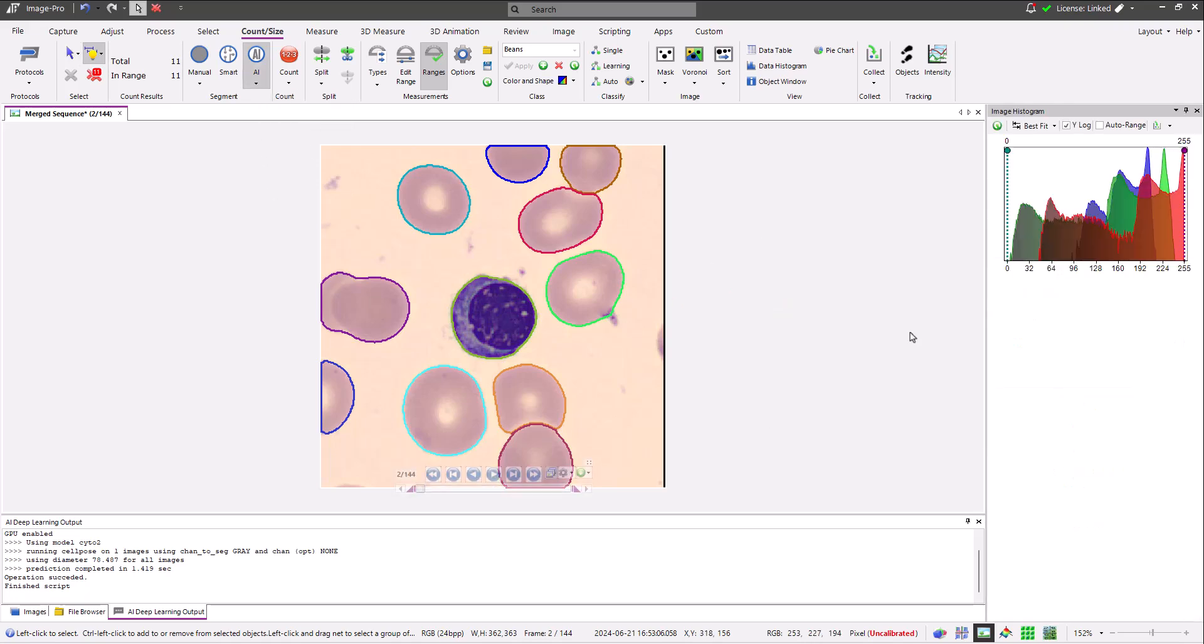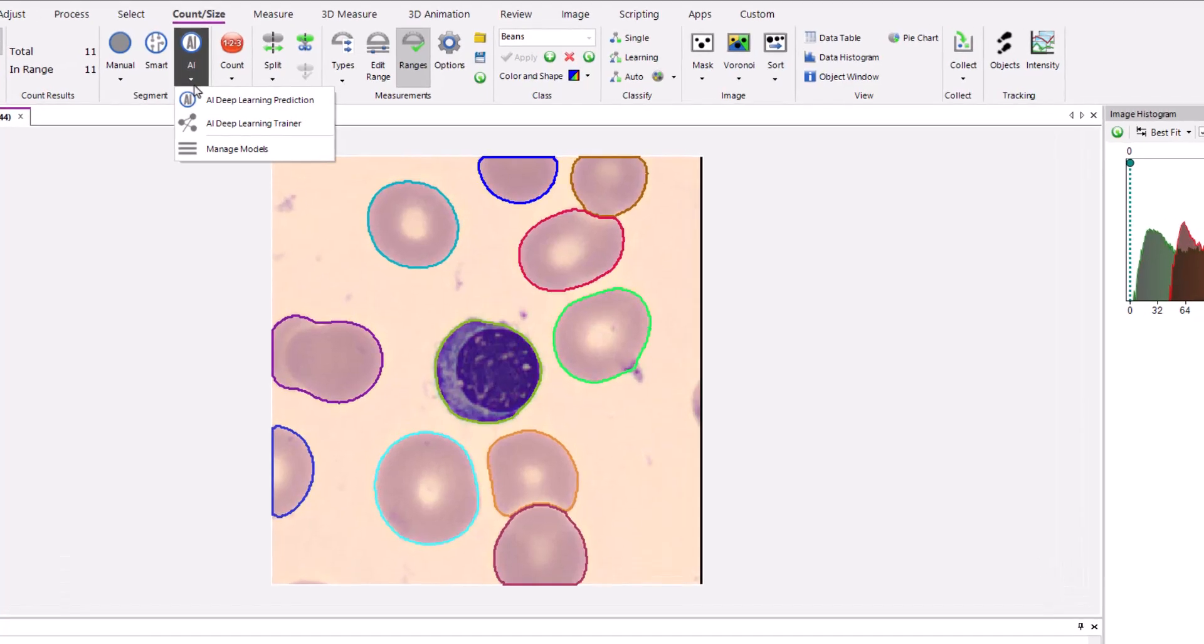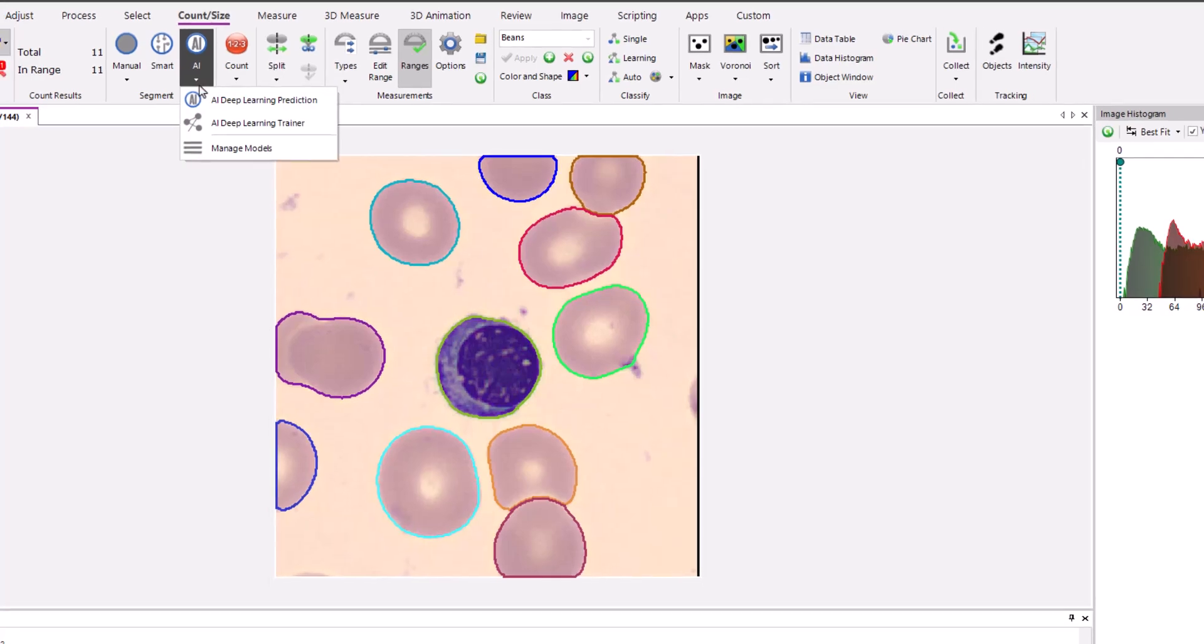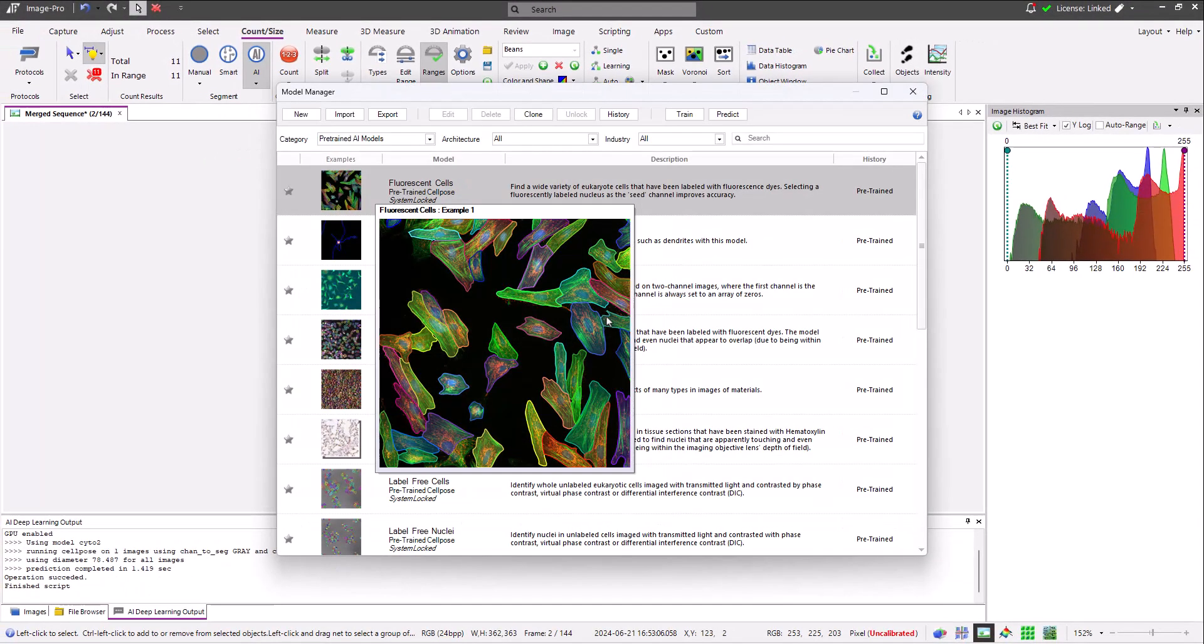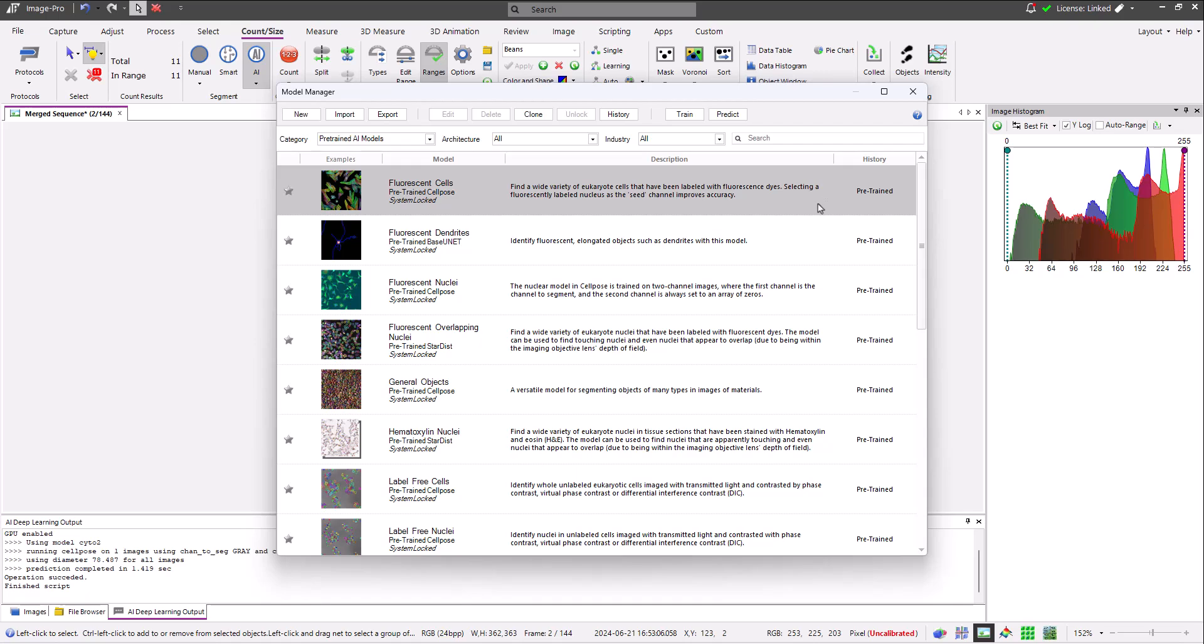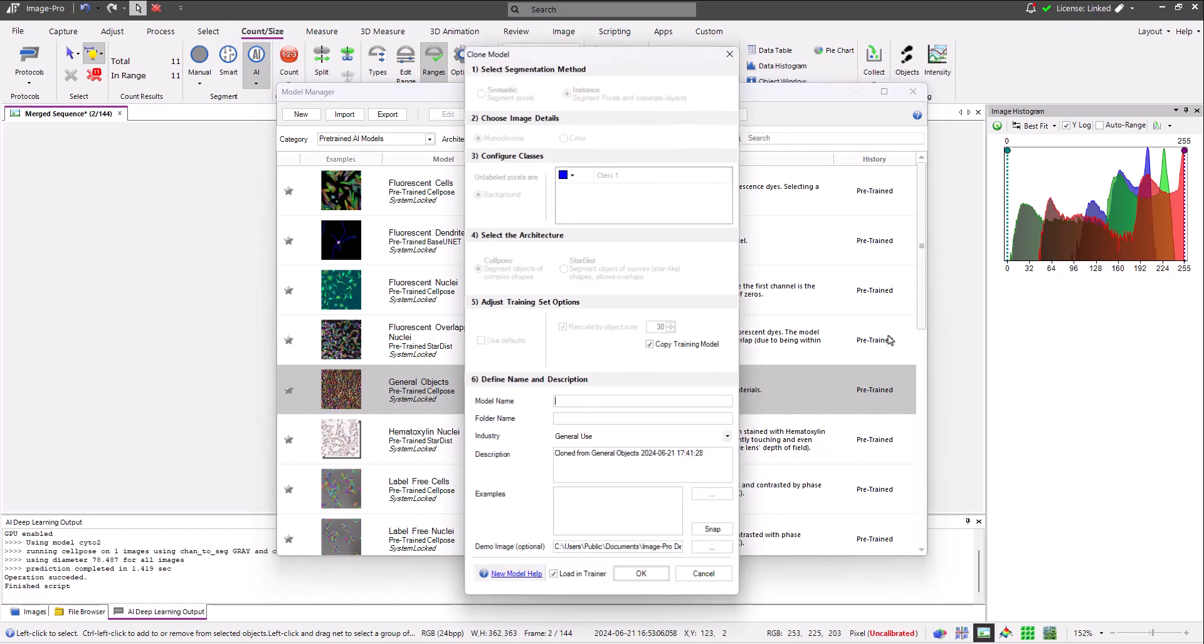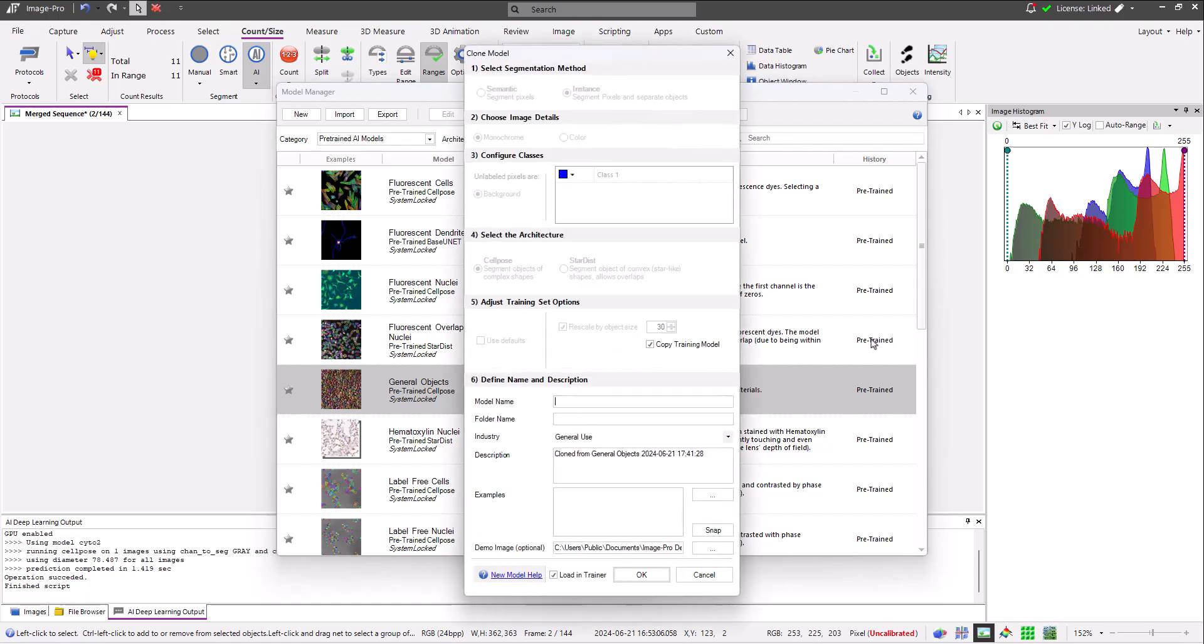To clone a model, open the model manager by clicking manage models in the AI drop down on the count size ribbon. Select the model that you wish to clone and click the clone button. In the dialog that opens, name the clone model then click OK. Here I've checked the option to load the clone model in the training panel which opens on the left.